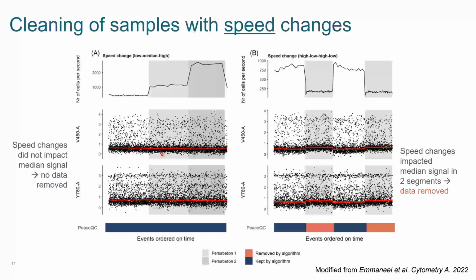in the raw data. Now, by contrast, when we look at the situation on the right, again, a purposeful speed change was introduced, right? We go from high to low, so we should be introducing some anomalies in these perturbation steps in gray, right? And we can see that that happens, right?